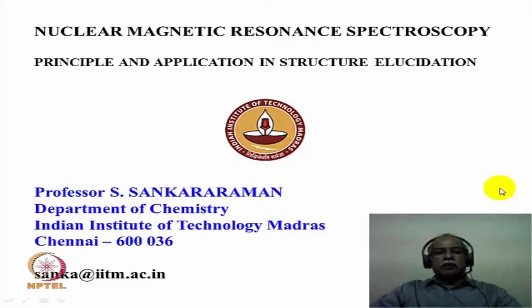Hello, welcome to the second module on the course on application of spectroscopic methods in molecular structure determination. In this module, we will consider nuclear magnetic resonance spectroscopy or the NMR spectroscopy. We will consider the basic principle behind this particular spectroscopic technique.